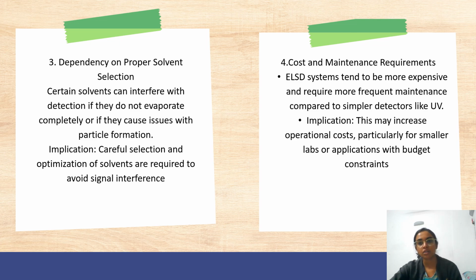Fourth is the cost and maintenance requirement. ELSD systems tend to be more expensive and require more frequent maintenance compared to simpler detectors like UV detectors. Implication: this may increase the operational cost, particularly for smaller labs or applications with budget constraints.